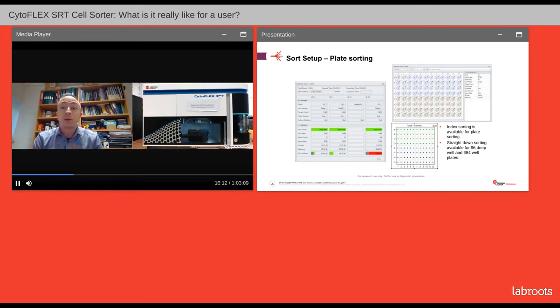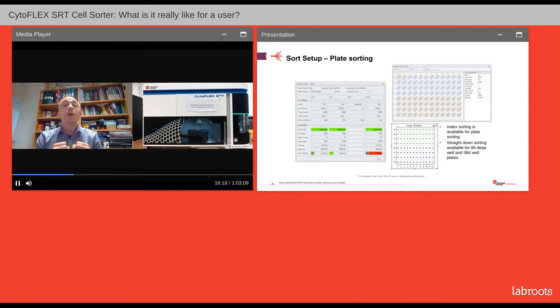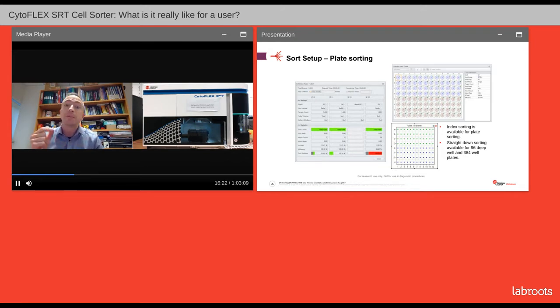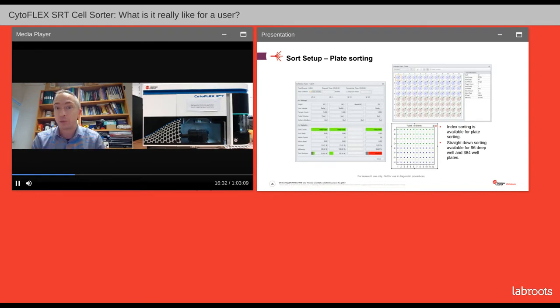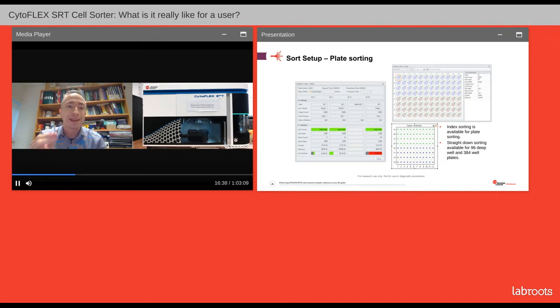What we'll show you in a little while is how we set up a plate sort. Most of our users do bulk sorting, but it's hard to show that in quick time, so we'll do a plate sort. When we do the plate sort, we'll take the plate live to a microscope and show you that it has sorted every event that it said it would sort. Karen, I think you're now ready for the next stage.